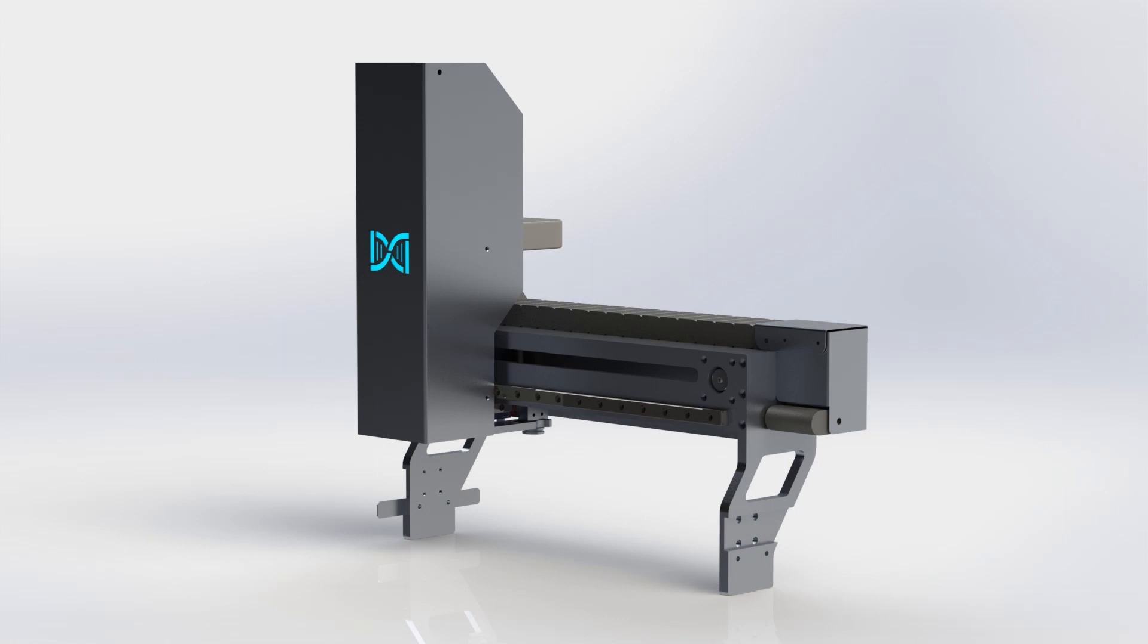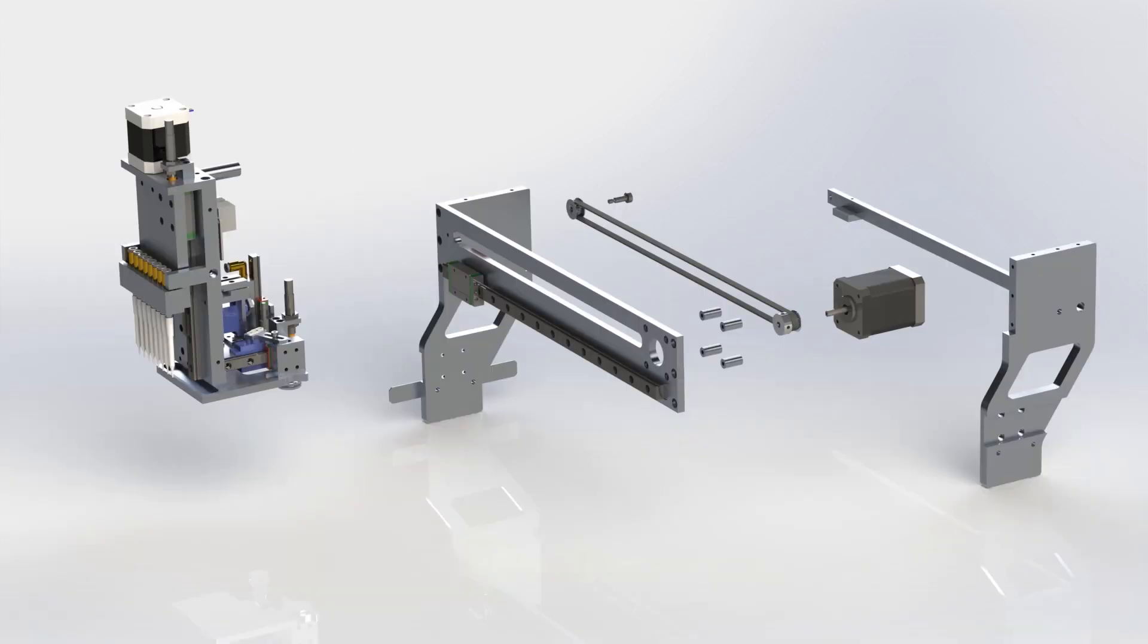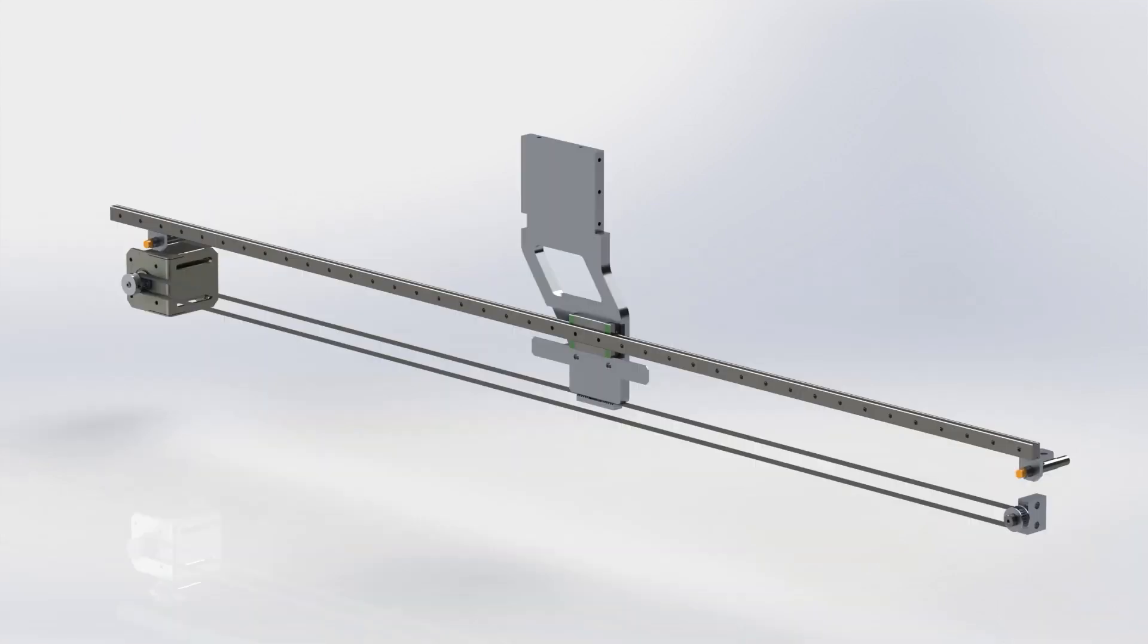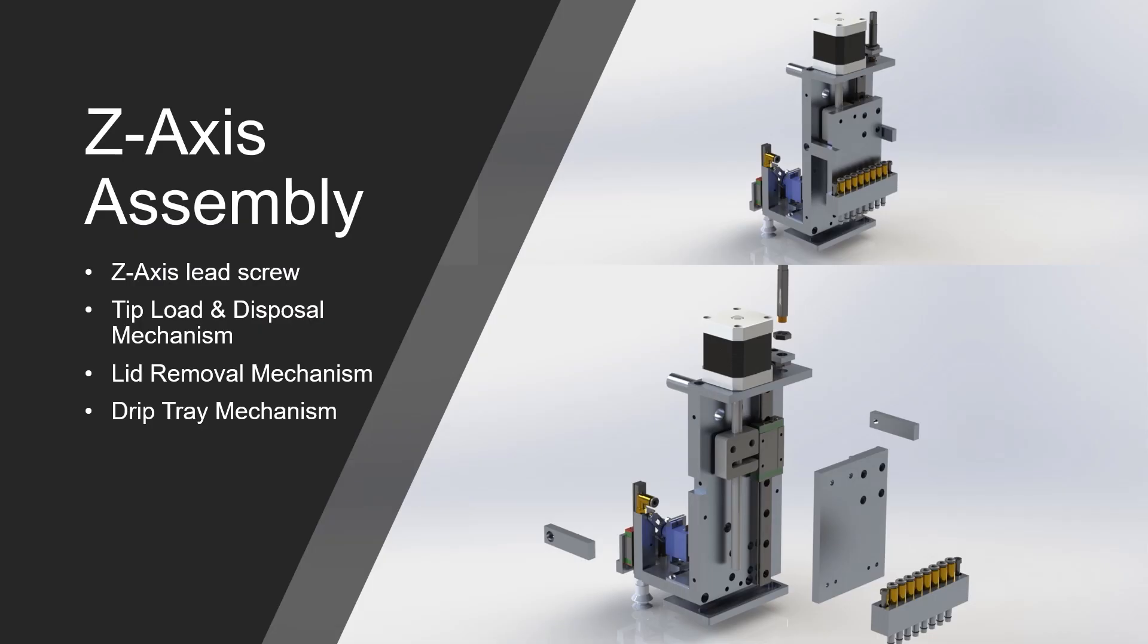This is the gantry of the machine. It is made from 6061 T6 aluminum. The X axis has a single linear rail and is driven by a NEMA 17 motor using a GT2 belt. The Y axis has a linear rail on each side and is driven on both sides by NEMA 17 motors and GT2 belts. Inductive proximity sensors are used for homing on all axes. The Z axis is driven by a NEMA 17 with an integrated 4 start 8mm pitch lead screw. It is guided by a single linear rail in an offset configuration to minimize size.